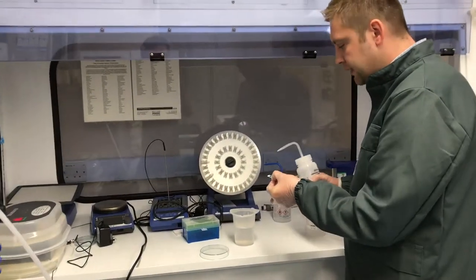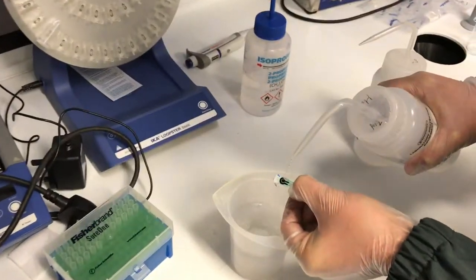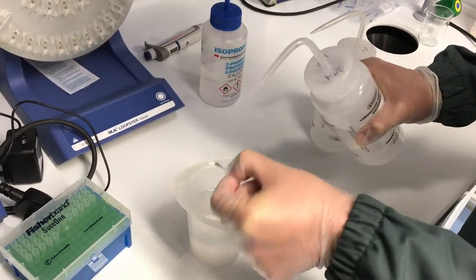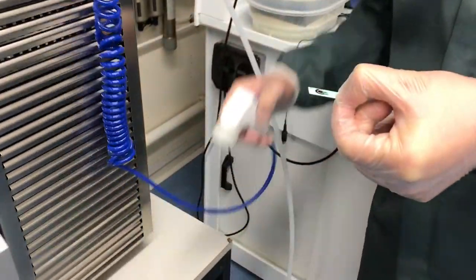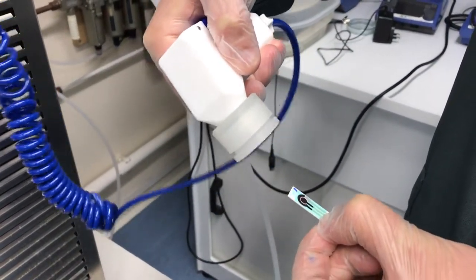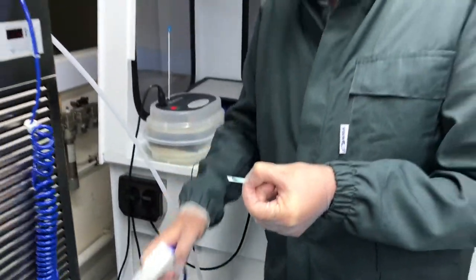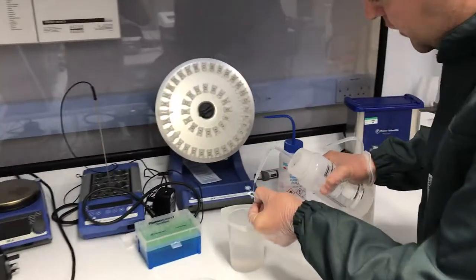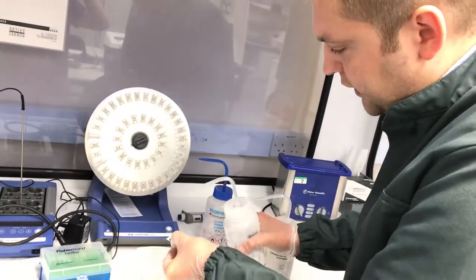We are going to show you how, by cleaning the previously modified electrode, we can demonstrate the features of the inks very clearly. We can also wash it again to show you the double process and the stability of the immobilization on these screen-printed electrodes.